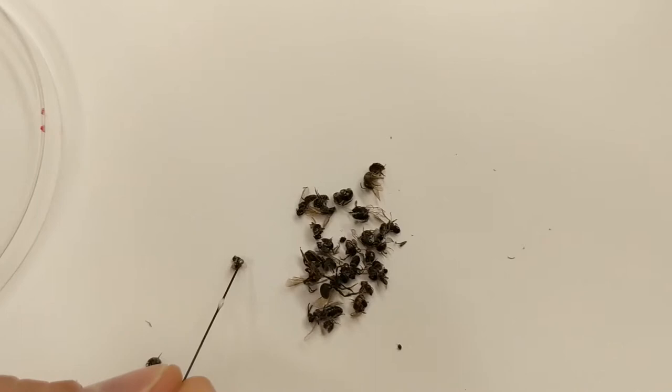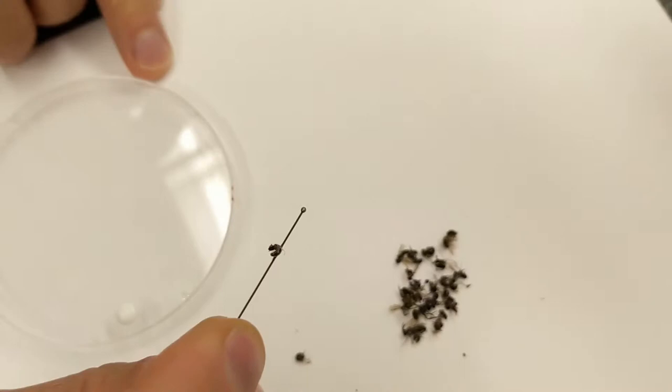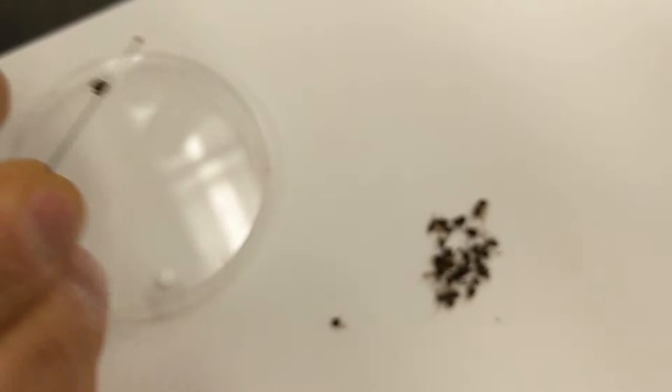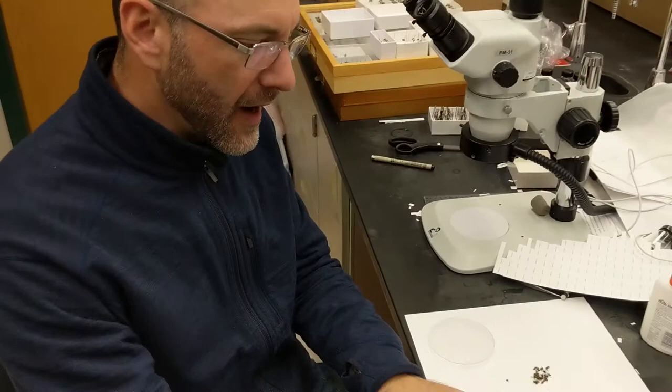Let's find another little tiny specimen — this little dialectus. Now it's all curled up; you just do the best you can. Once you have a little system going, you can do a bunch of them at a time.